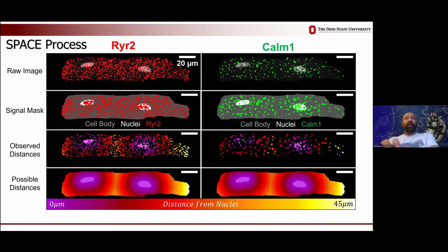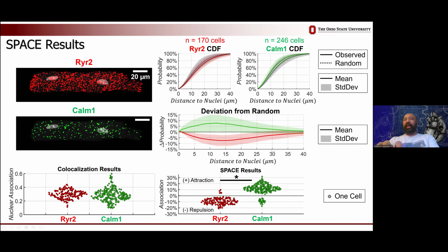So we did this with their RNA data. We segmented them. We used exact Euclidean distance transformations to efficiently calculate these distances, both for observed and random cases. And when we plot those, first thing you see is the red curve is right shifted from my dotted black line versus the green curve is left shifted. And when we look at the difference curves, they have opposite polarity, meaning green RNA are attracted to the nuclei versus the red RNA are kind of repulsed by the nuclei.